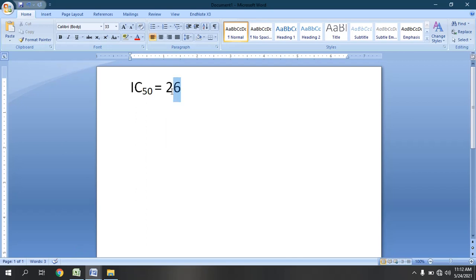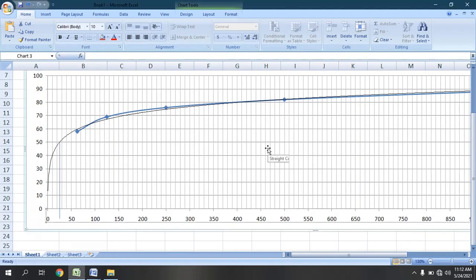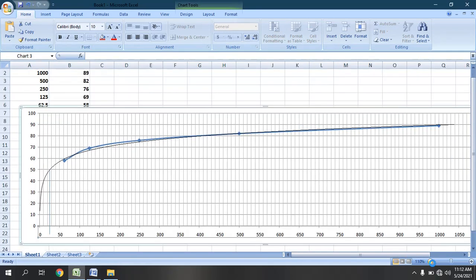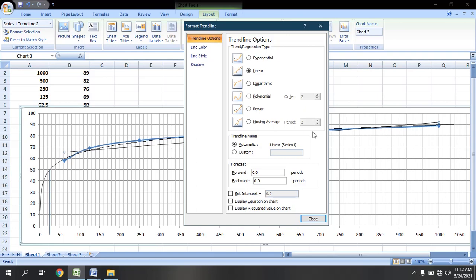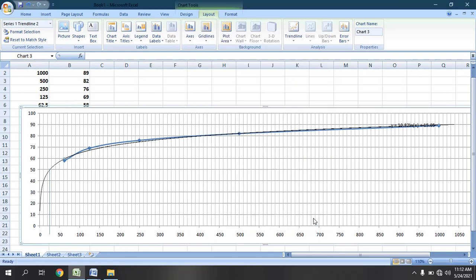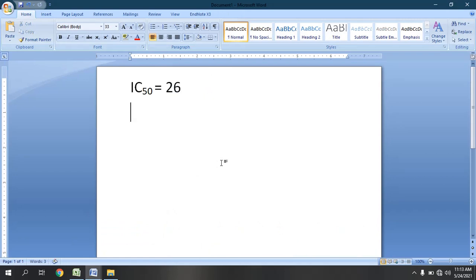To confirm this 26 ppm value or get a more precise IC50, we can get the formula from this graph. We will go to Layout, then Trend Line, then More Trend Line Options. After going to More Trend Line Options, we will select logarithmic and then check 'Display Equation on Chart.' We will get the logarithmic equation. We have already obtained this equation on the chart, and now I am going to copy and paste this equation for further use.